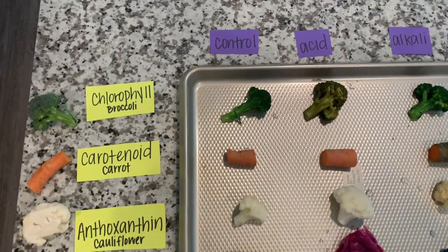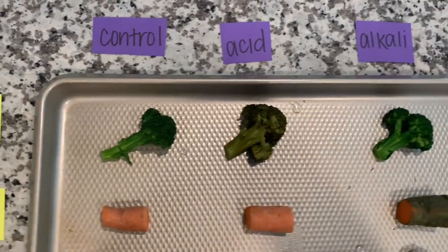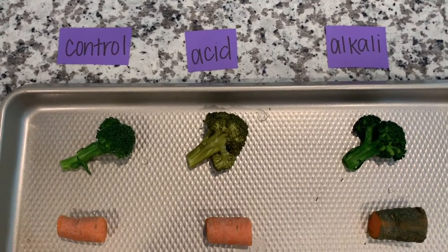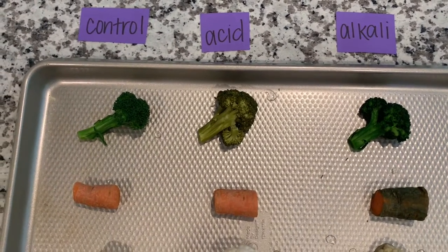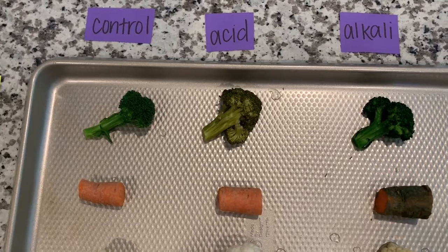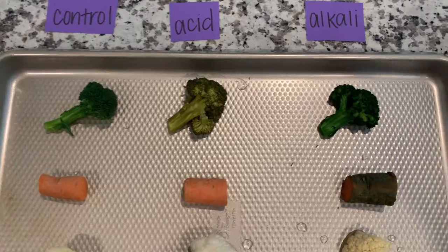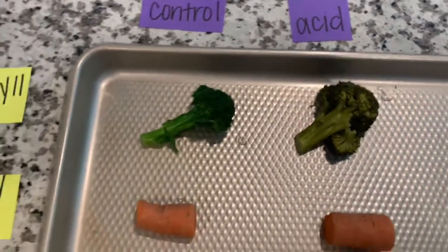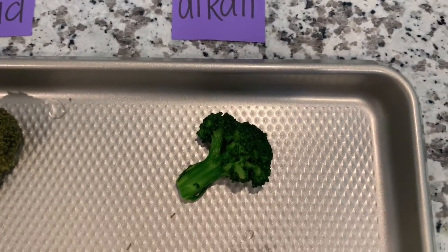So I'm gonna start with broccoli, the chlorophyll. So broccoli and the acid became that olive brown color due to the pheophytin, as talked about in the textbook and in lecture. The acid comes in contact with the chloroplast, in which the hydrogens replace the magnesium in the chlorophyll, resulting in the olive brown compound. And then you see in the alkali, it's a brighter green compared to the control and the raw, obviously. The alkali has that bright green, it's really pretty.